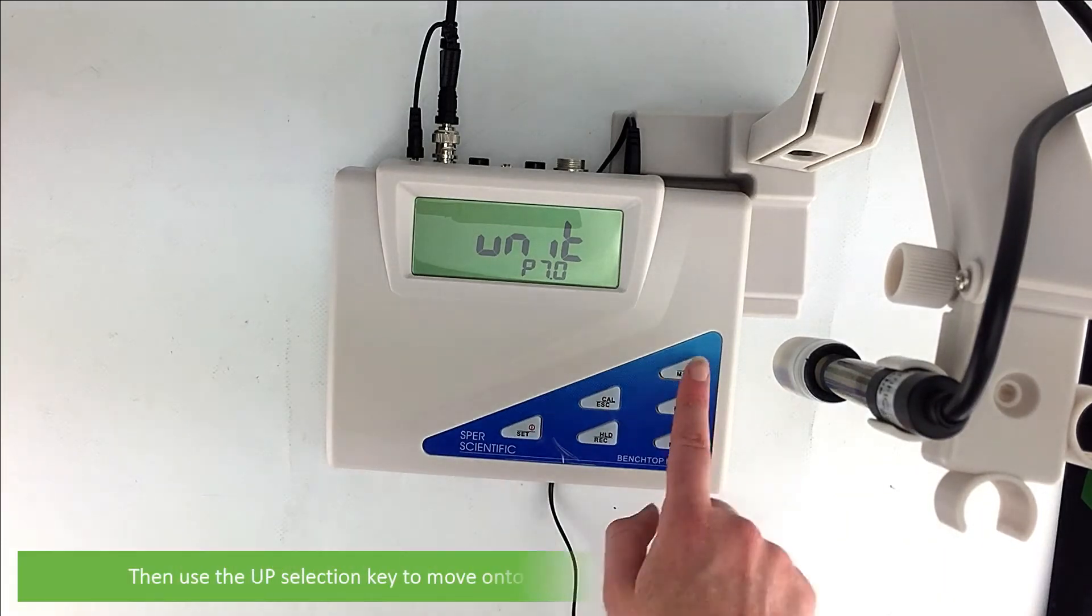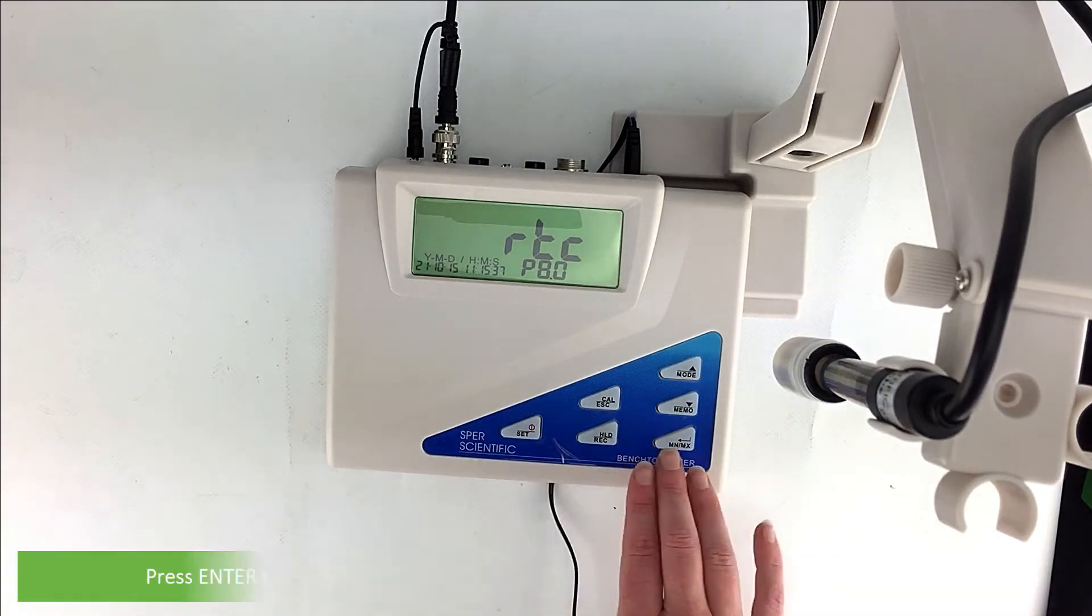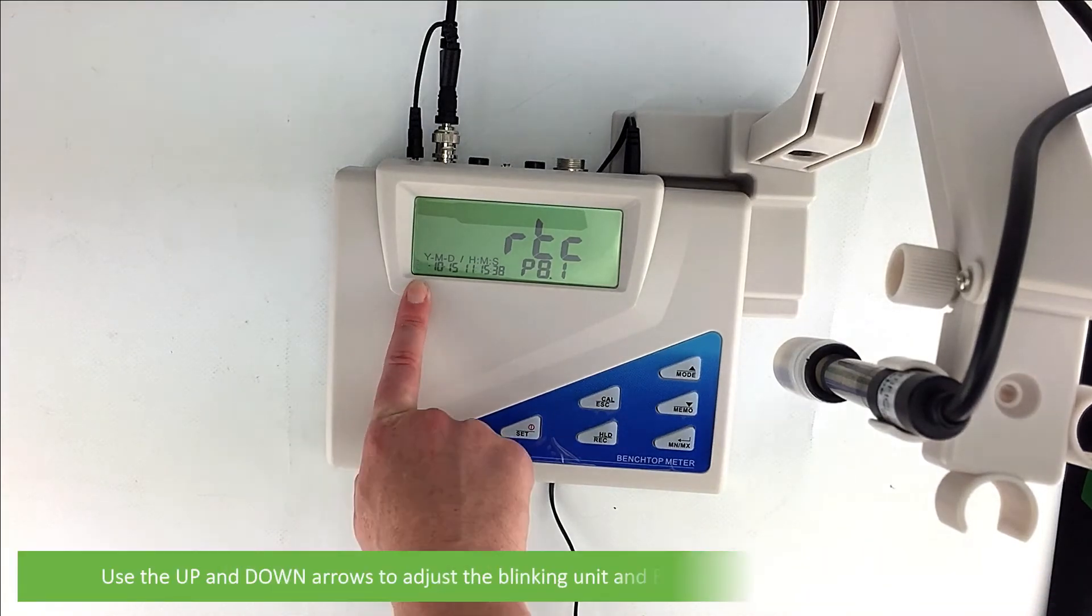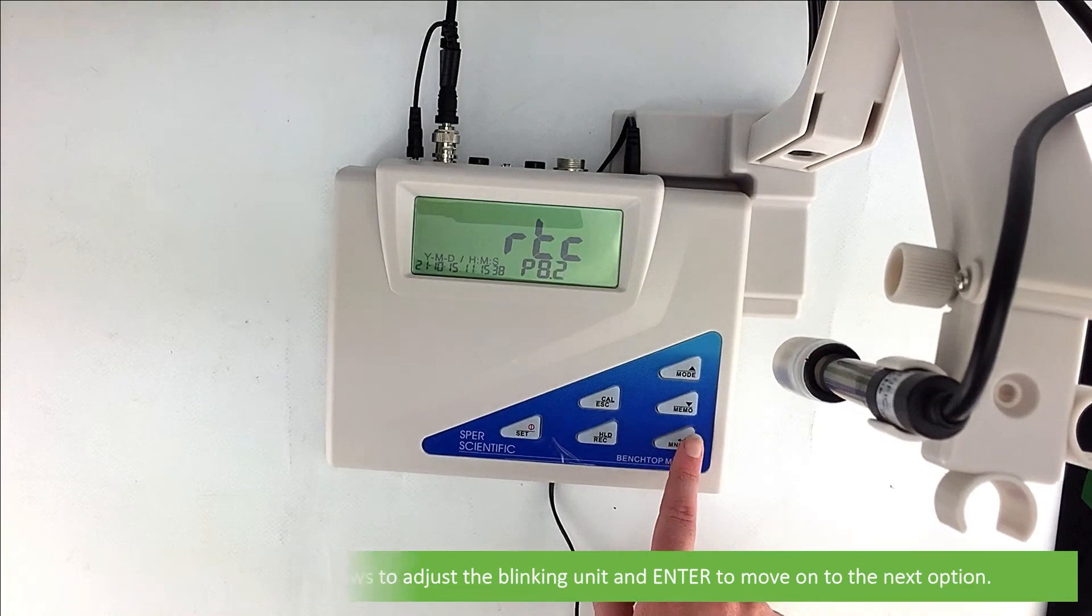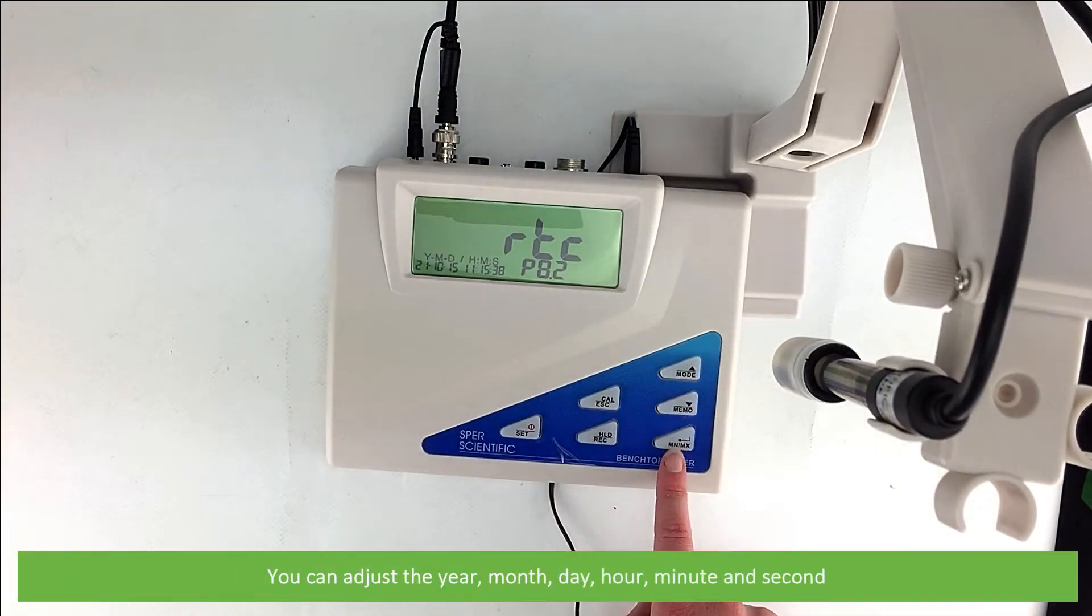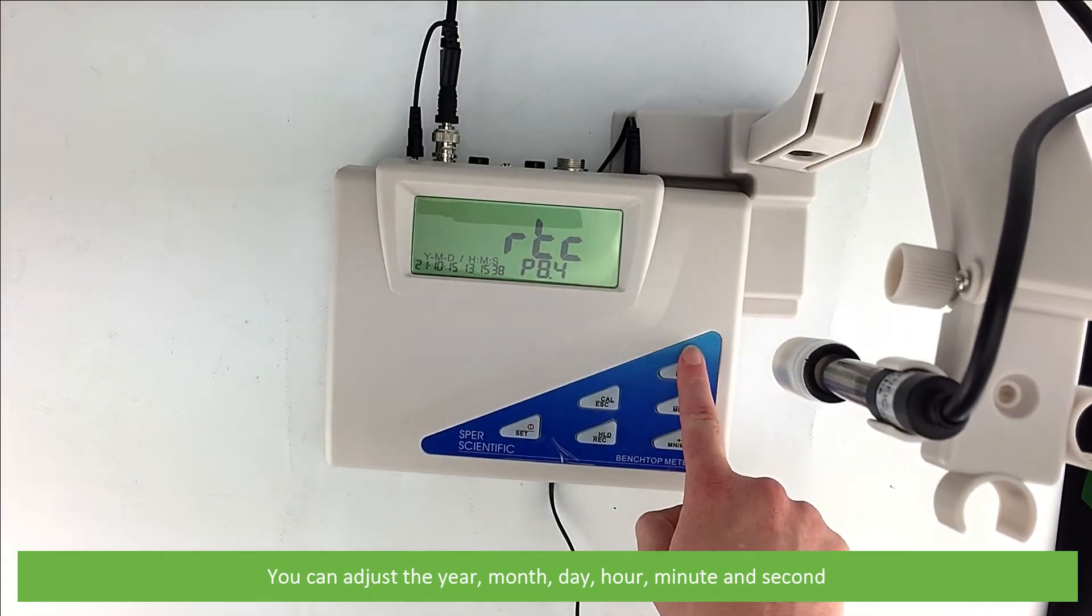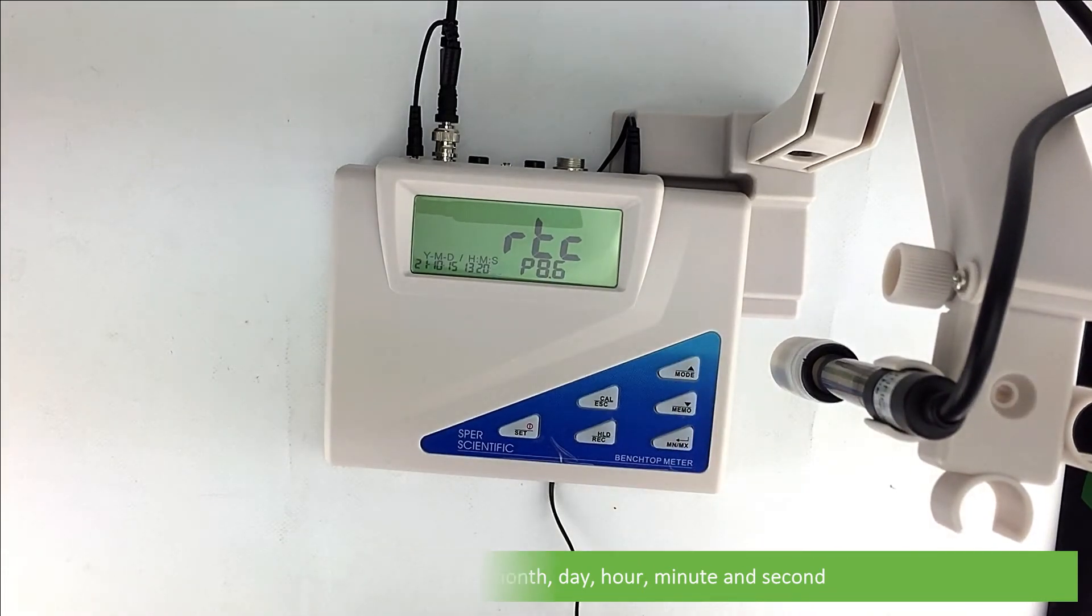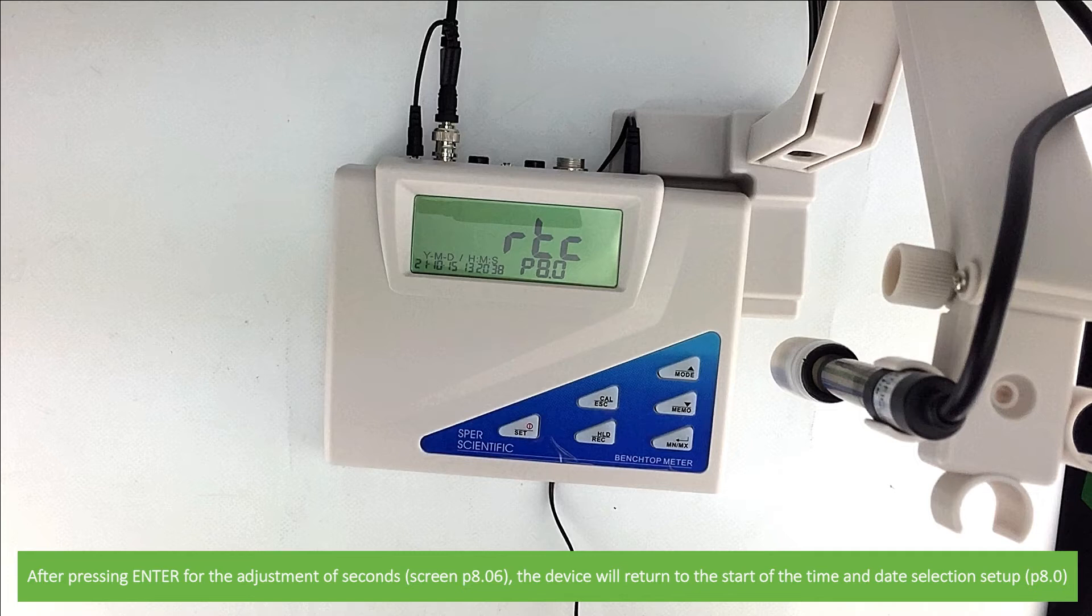Then use the up selection key to move on to the next settings option. It's time and date selection. Press enter to adjust the time and date. The unit to be modified will blink on the display. Use the up and down arrows to adjust the blinking unit. Then enter to move on to the next option. You can adjust the year, month, day, hour, minute and the second. After pressing enter on the adjustment of seconds, the screen will return to the start of the date and time selection setup.